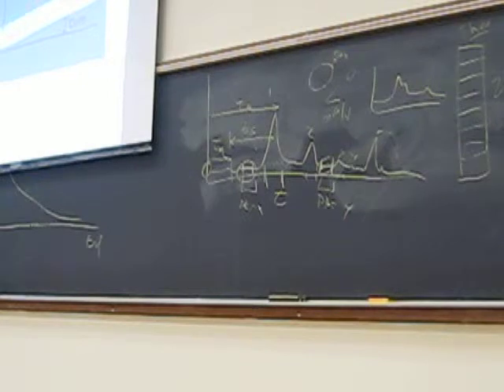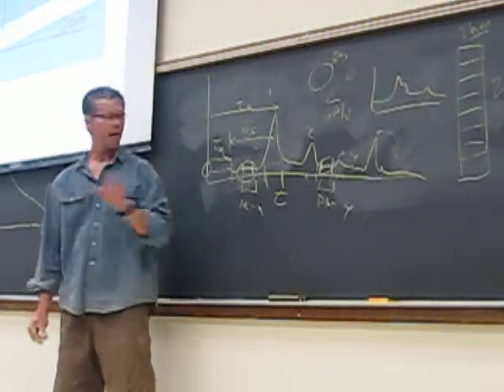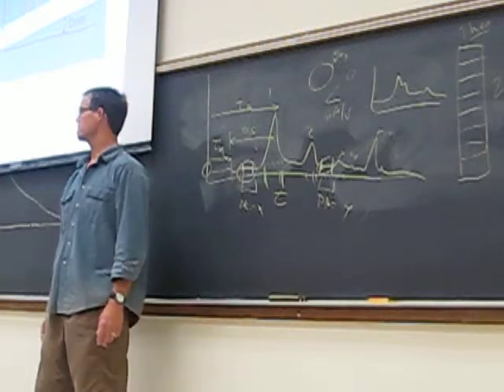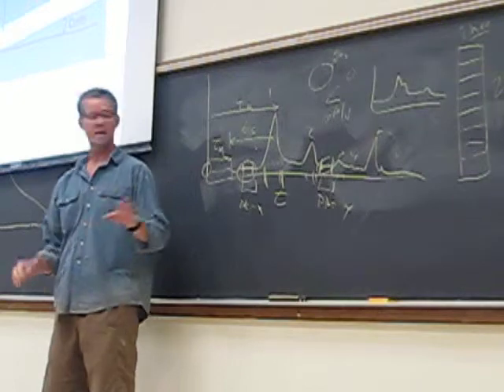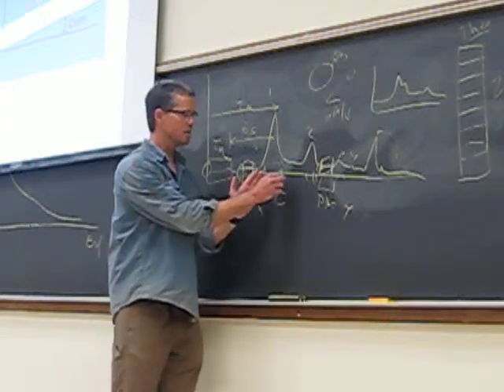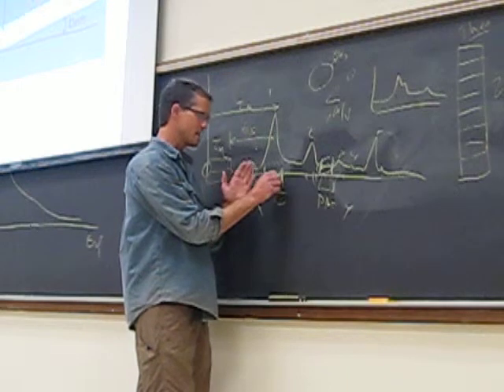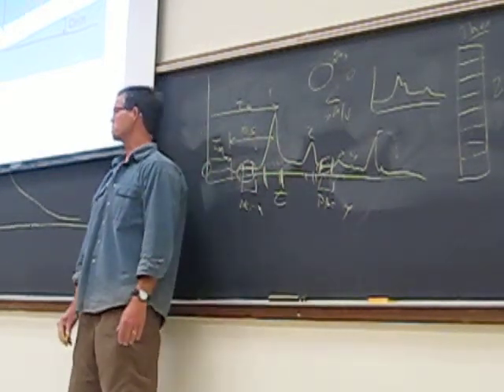Optimally, you'd shoot 1 blank, and then I would look at this and look at this, and you do that. That's the other approach. If you had no blanks, then you would look here and here in the baseline. If you shoot 1 blank, you could use exactly the same chromatogram analysis setup and look at the peak areas in the same intervals where you normally find your peaks.